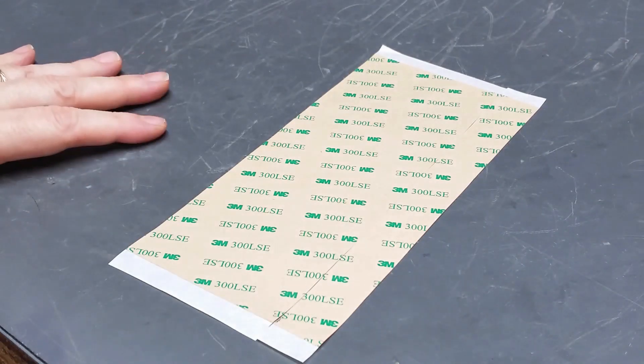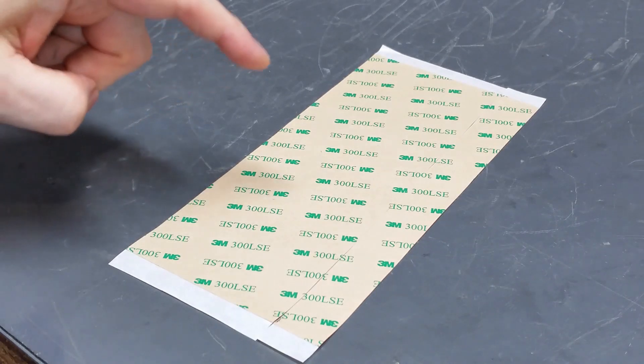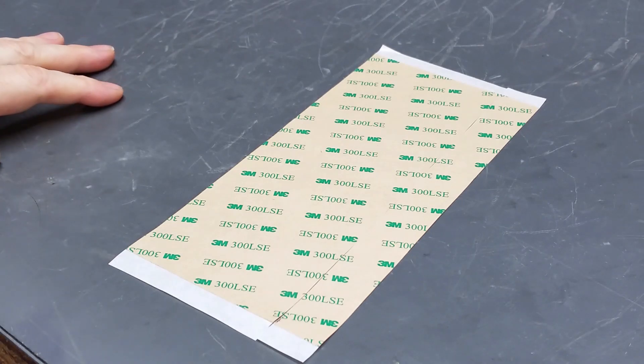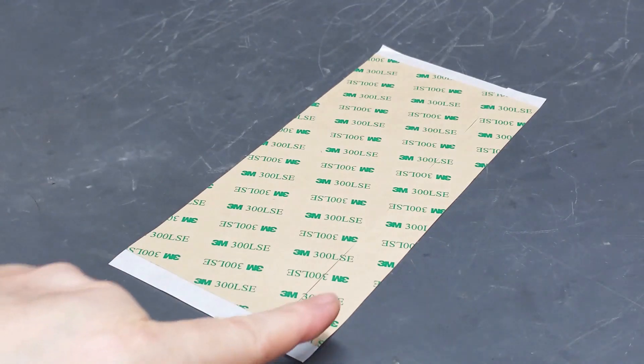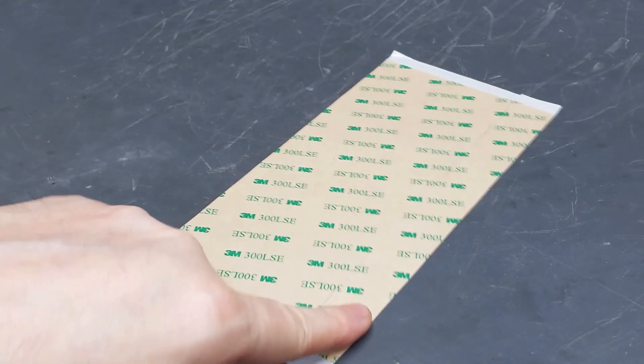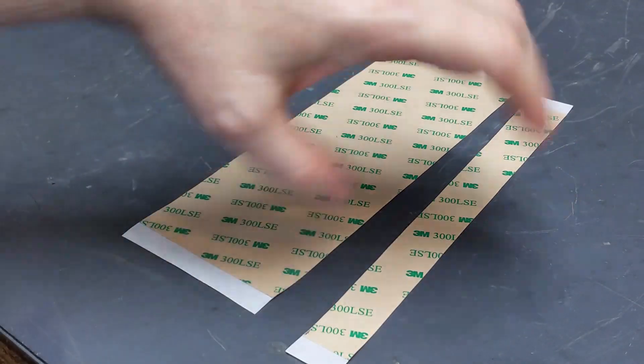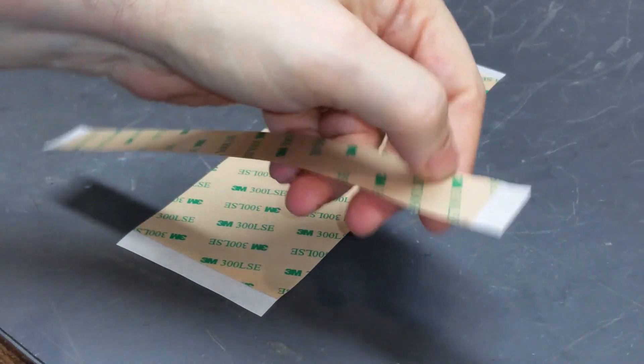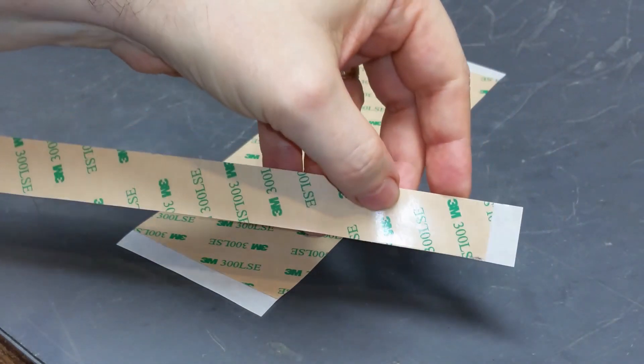I have here a sheet of 3M 300 LSE adhesive. This is something that I picked up on Amazon. What I've done is I've cut off a piece just a little bit wider than three quarters of an inch, because we're going to need to punch some three quarter inch circles, three quarter inch or 19 millimeter.